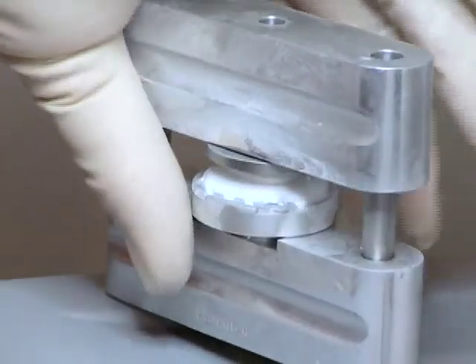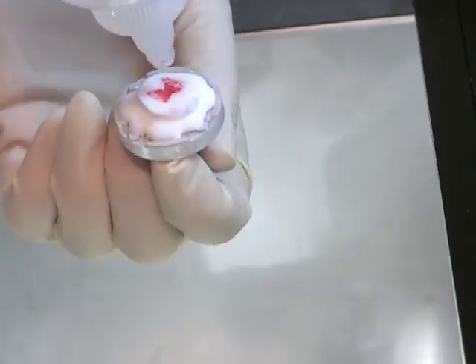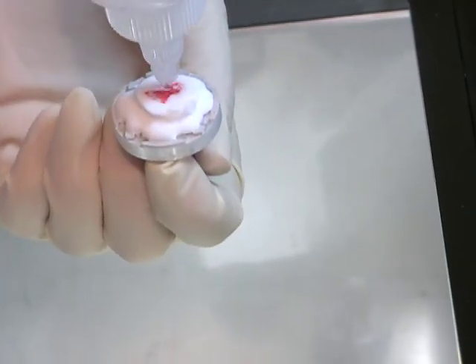Although the design of the cryoEmbedder reduces the need to make major adjustments of the block to be in alignment with the blade, it's best to be cautious and apply a thin buffer layer to prevent the blade from damaging the specimen.